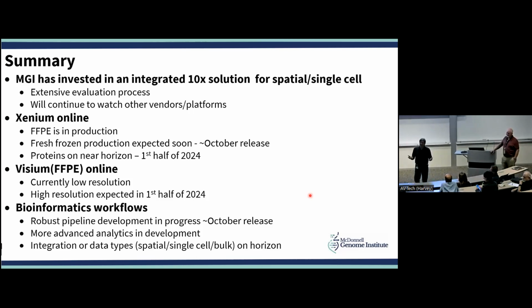That's a very good question, and I'm not sure. I mean, it tends to be the better expressed transcripts, but it's not always the case, right? We see this with single cell too. You go in with single cell, and I don't care how deep you sequence with Chromium, you're going to pick up 5,000-6,000 transcripts depending on the cell type. And most of the time, those tend to be higher expressed transcripts, but not always.